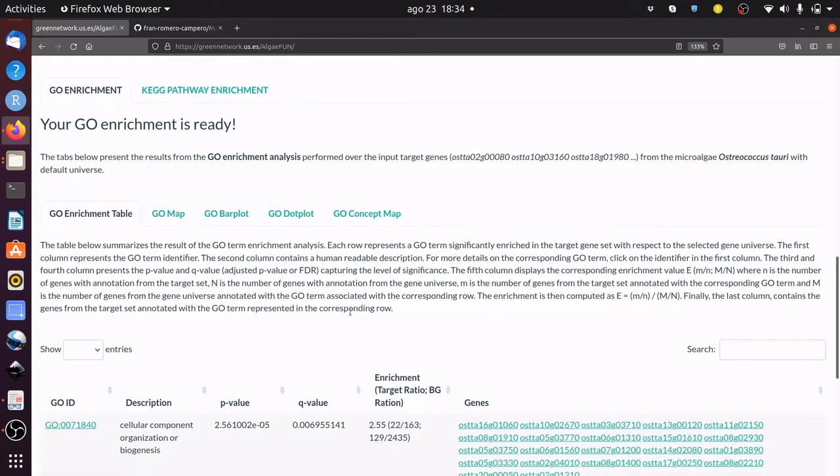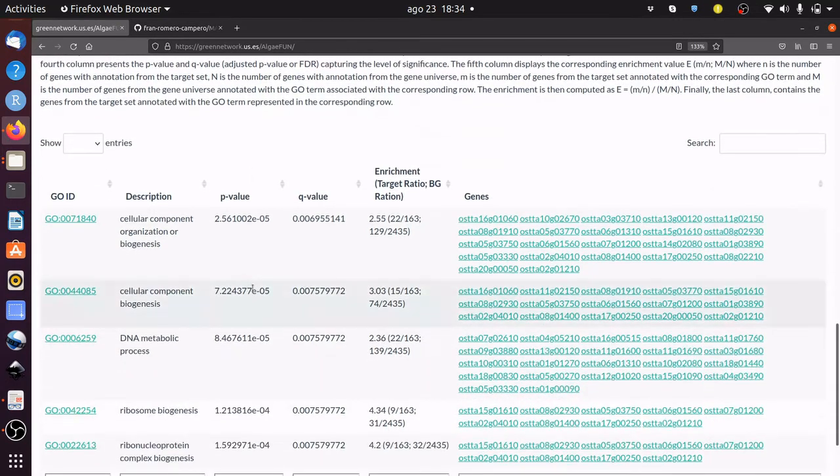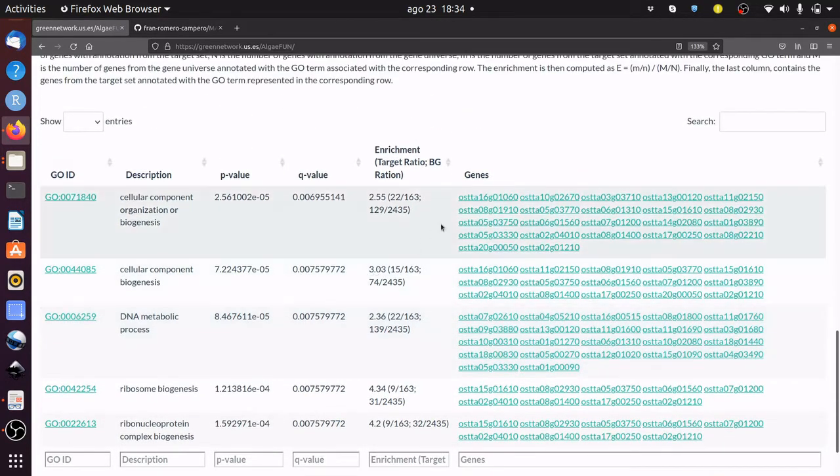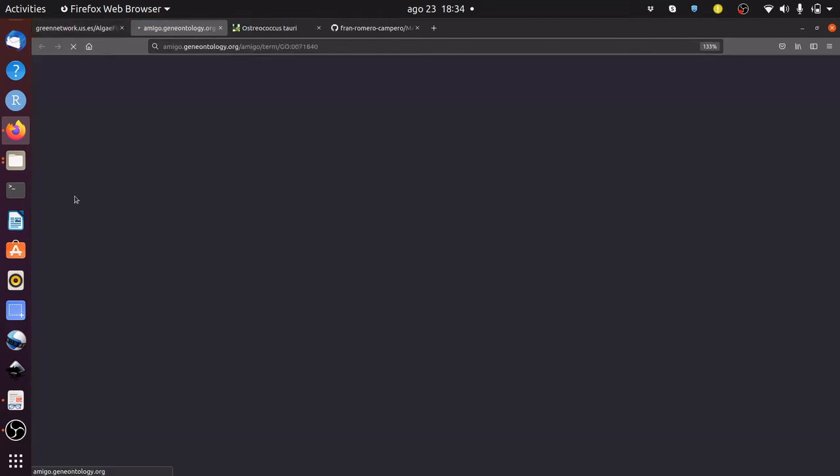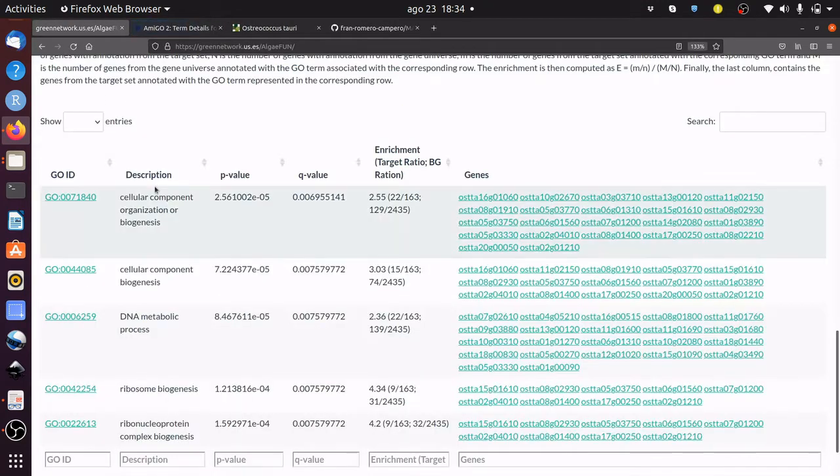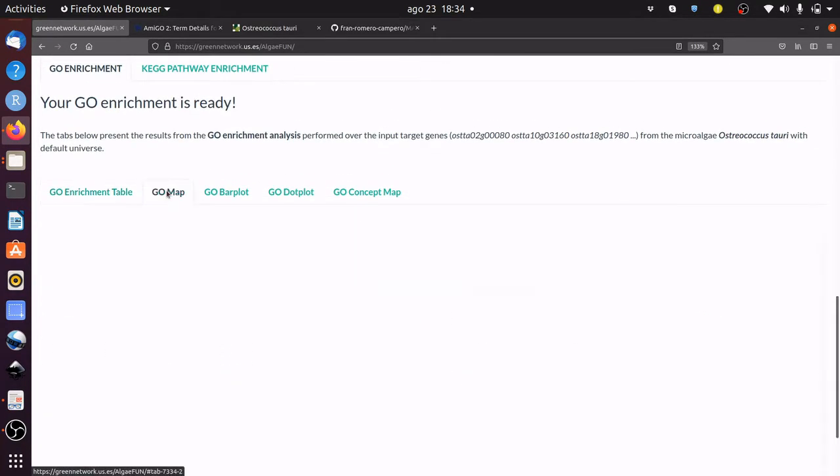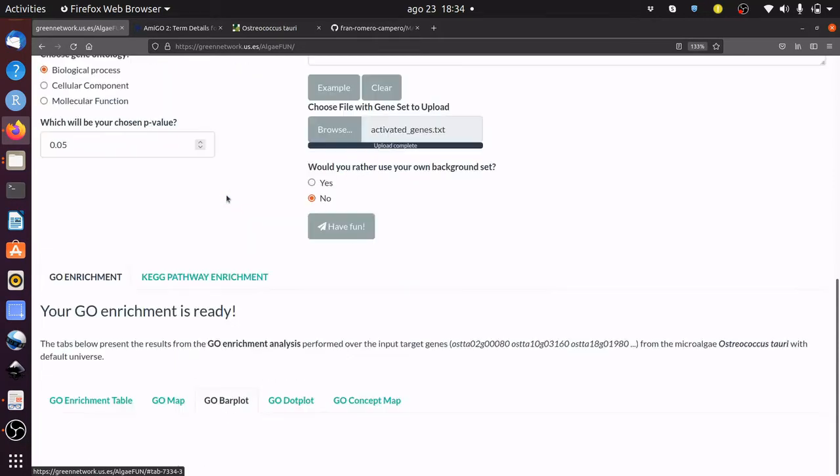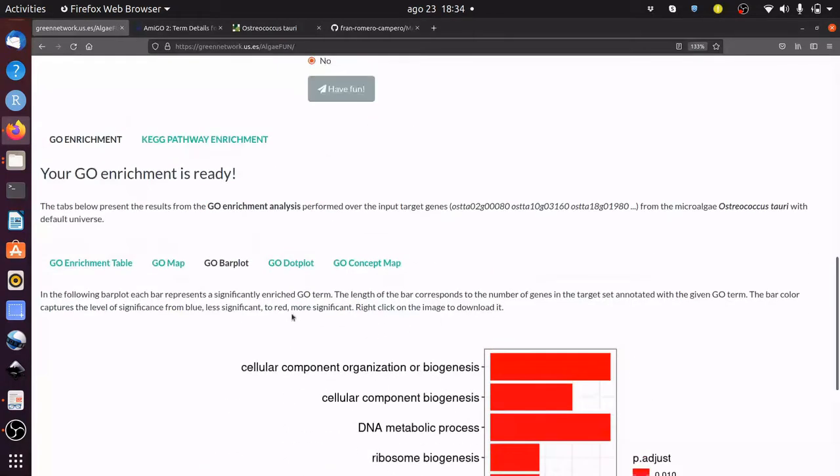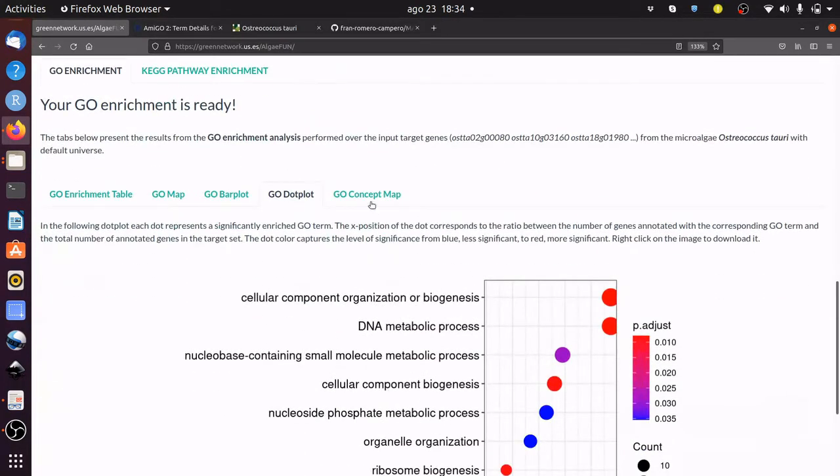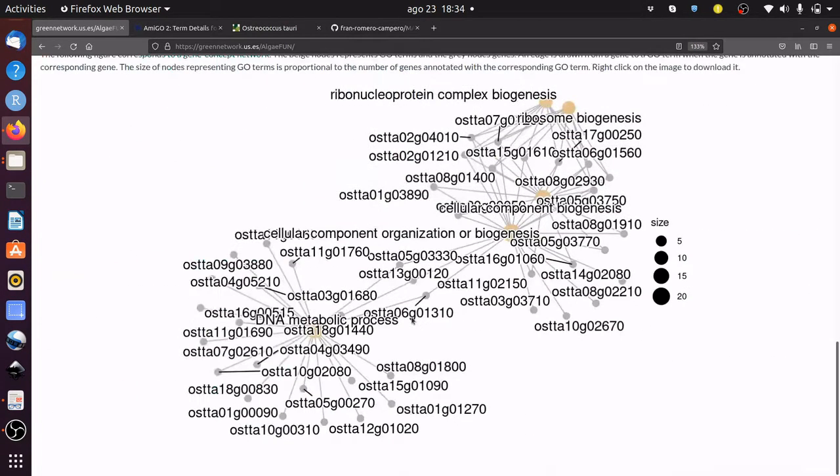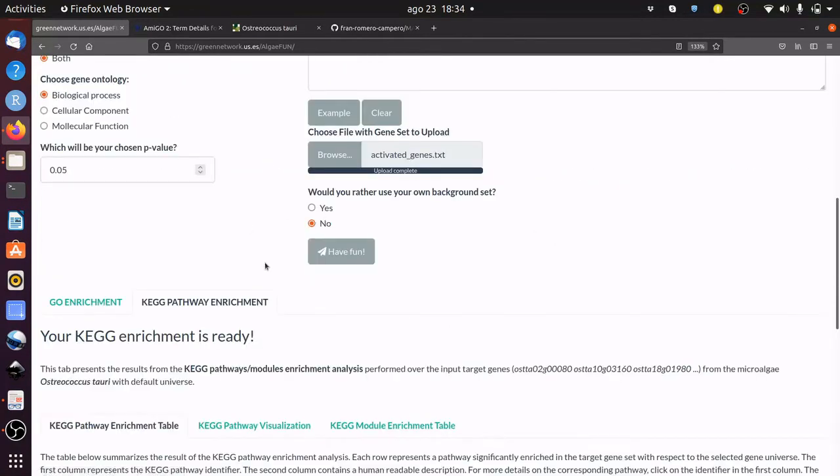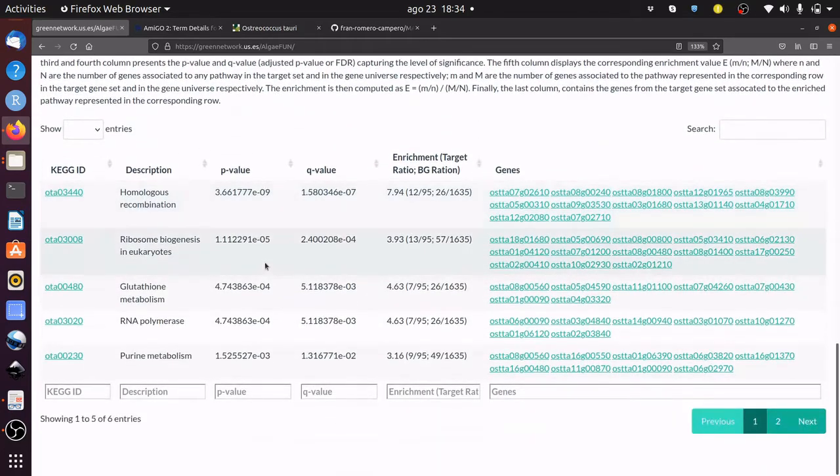The results are presented in different tabs. The table of enriched GO terms can be downloaded and explored by clicking on the different links. Graphical representations of the results are presented as acyclic graphs, bar plots, dot plots, or concept maps. Similarly, you can explore and download the results from a KEGG pathway enrichment analysis.